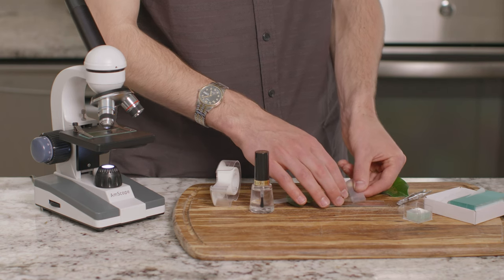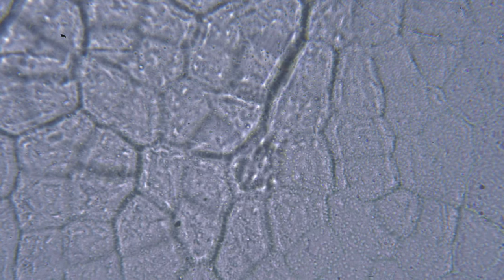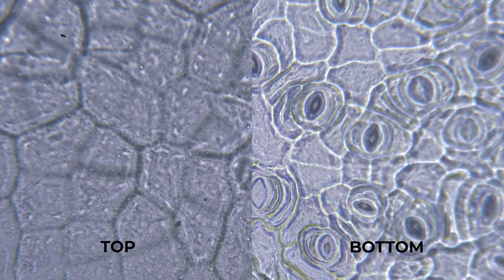Let's take a look and see what it looks like under the microscope. Now, let's take the tape and the nail polish off the bottom of the leaf and see if it looks different than the top. What do you see now? Let's compare the bottom of the leaf and the top. Do you see the tiny pores on the bottom of the leaf, but not the top?